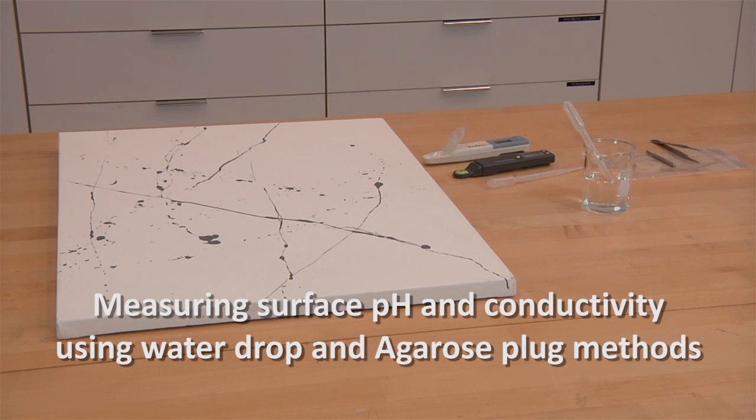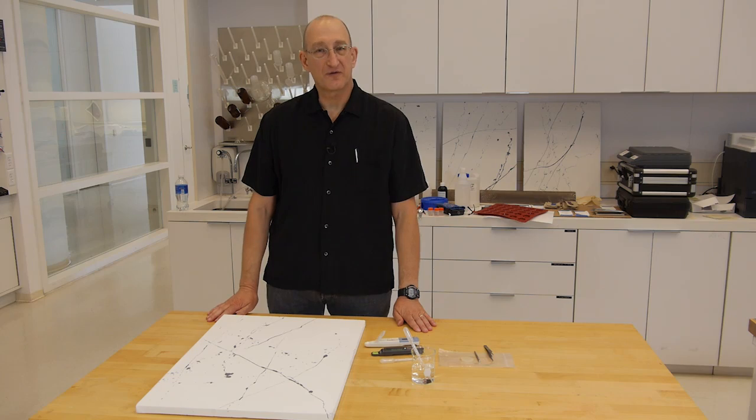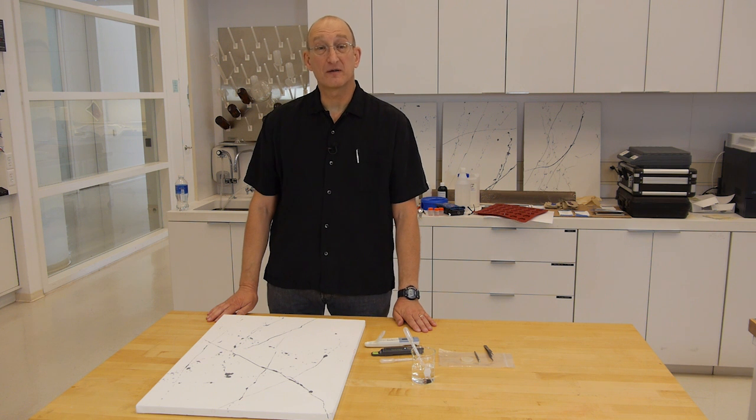We're going to measure the surface conductivity and pH of the sample painting in two different ways. The first, we're going to use a drop of water, which is the less good way, but more straightforward conceptually.